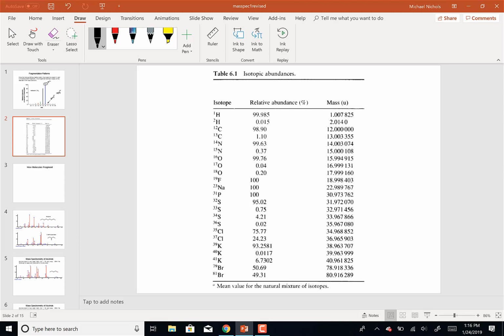So you can actually make enriched proteins in carbon 13 and N15 by feeding them what's called a labeled media. But we're basically going to limit ourselves to natural abundance. So we're not going to see much deuterium unless it's been enriched in deuterium.